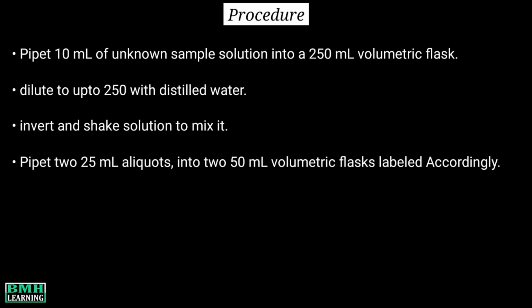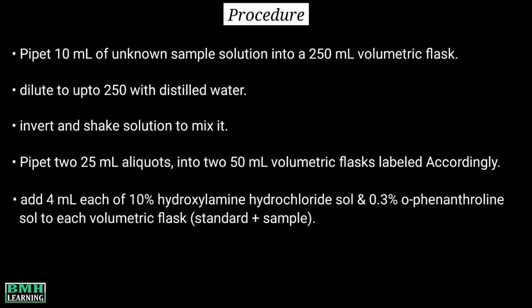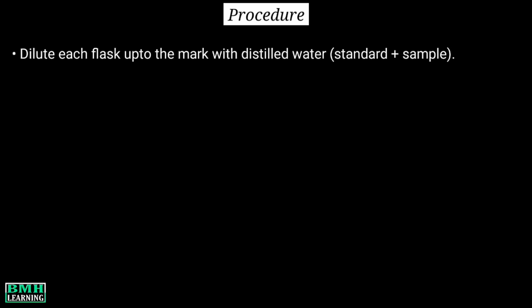Using a 10 ml measuring cylinder, add 4 ml each of 10% hydroxylamine hydrochloride solution and 0.3% orthophenanthroline solution to each volumetric flask. The mixture is then allowed to stand for 10 minutes. Dilute each flask up to the mark, that is up to 50 ml, with distilled water. Mix well by inverting and shaking the flask.